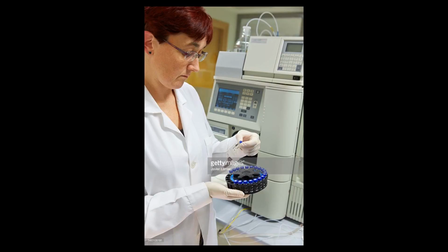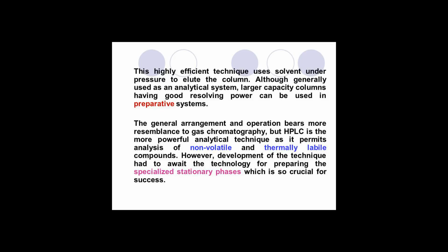For example, the addition of inorganic salts causes a moderate linear increase in the surface tension of aqueous solutions, circa 1.5 times 10⁻⁷ J per square centimeter per mole for sodium chloride, 2.5 times 10⁻⁷ J per square centimeter per mole for (NH4)2SO4, and because the entropy of the analyte-solvent interface is controlled by surface tension, the addition of salts tends to increase the retention time.